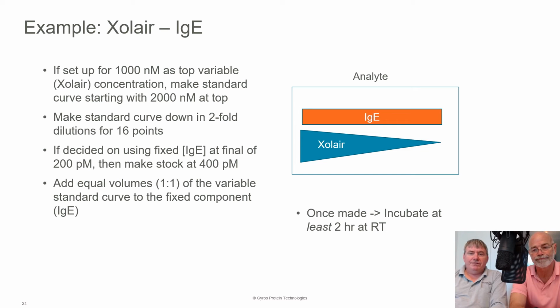Yeah, so the 1,000 nanomolar Xolair is approximately 50 times the expected KD. So that's kind of the logic behind that starting concentration. And as mentioned, we know that the affinity is reasonably low, so we incubate for 2 hours at room temperature to actually perform this experiment.